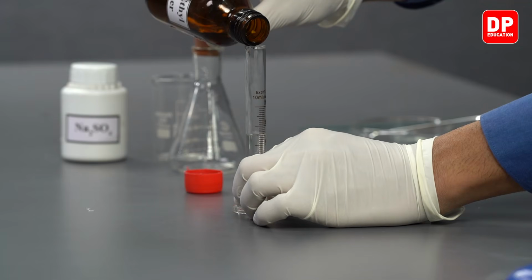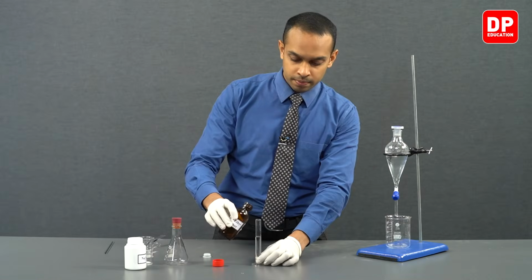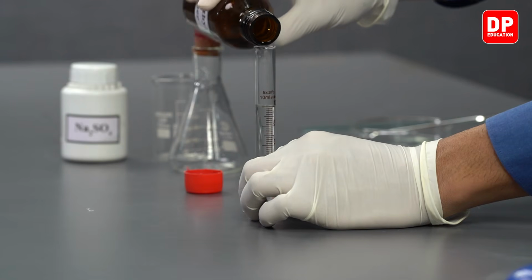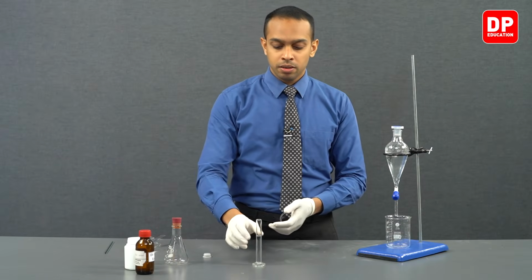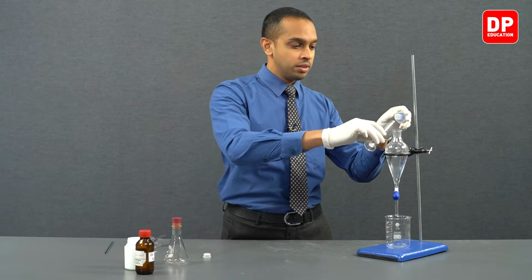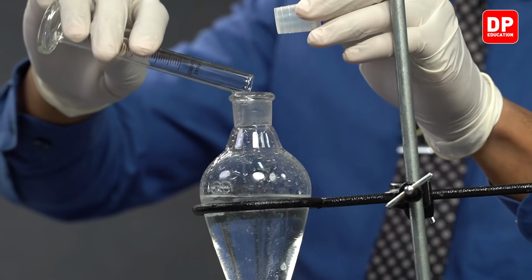We are going to measure 10 cubic centimeters of diethyl ether. Now, we'll transfer this 10 cubic centimeters of diethyl ether into our aqueous mixture that we have here.